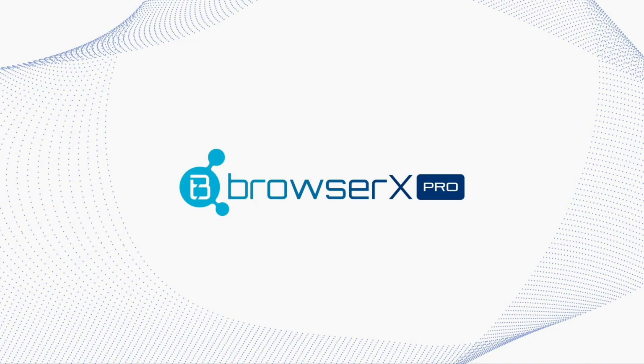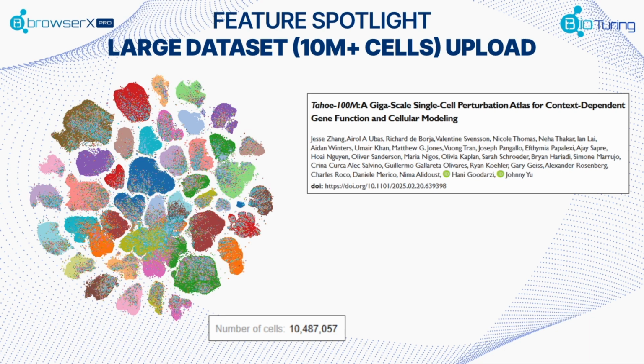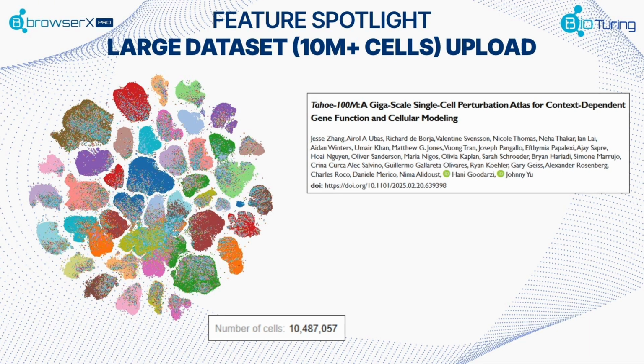Before we begin, I'd like to introduce the features that are available on the platform. For long-term and returning users, you'll recognize that we have another platform, BBrowserX. BBrowserX Pro is the upgrade to that with more advanced analytical tools and optimized processing times. One of the biggest motivators behind building a Pro version is the need to support very large data sets.